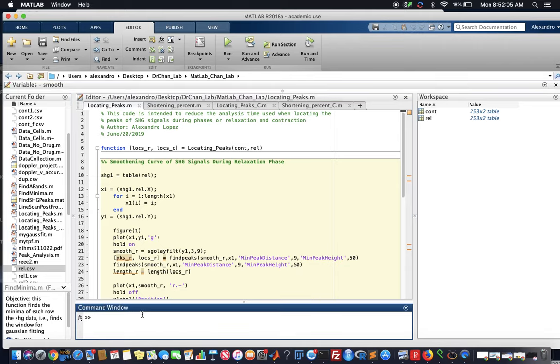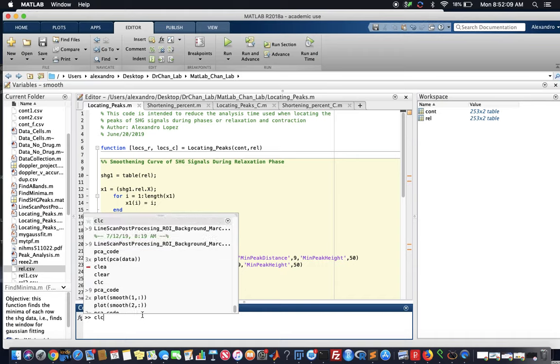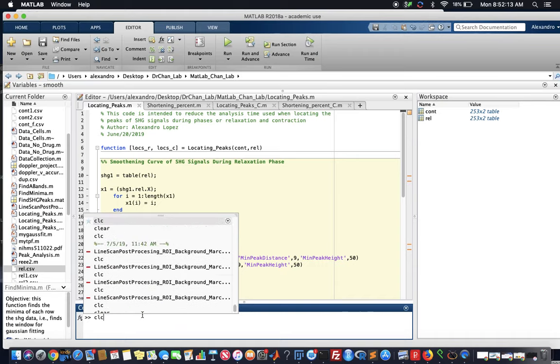So here at the bottom, you're gonna want to type that top line. Let's see here, find it. All right, let's just go ahead and type it ourselves.